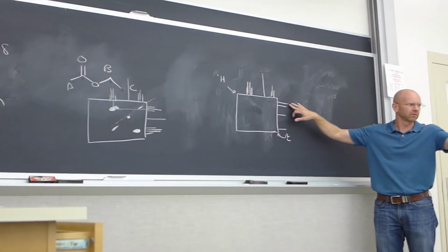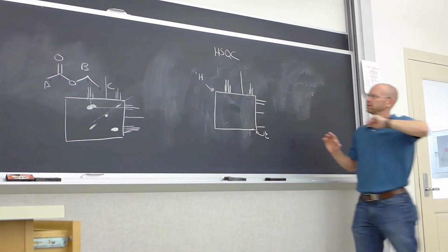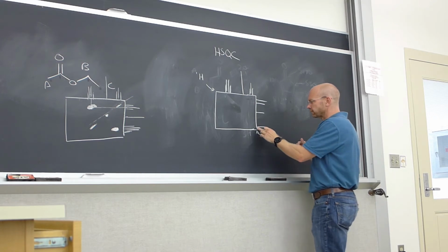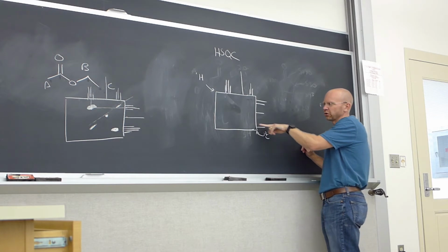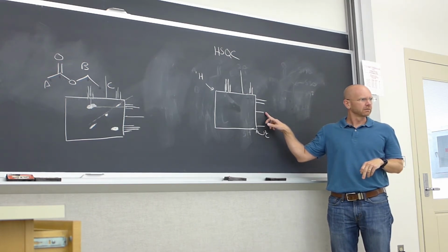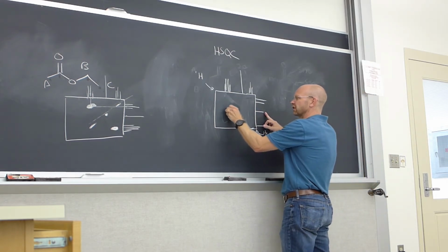So you have the spectrum right in front of you, right? I'm just doing it approximately. In an HSQC, cross peaks appear when a carbon is attached to a proton. So there are no protons attached to this carbon. That's the carbonyl carbon, so there are no cross peaks for this one. This one is the carbon that has the oxygen attached to it. That's the same carbon that has this quartet, so you would see a cross peak.